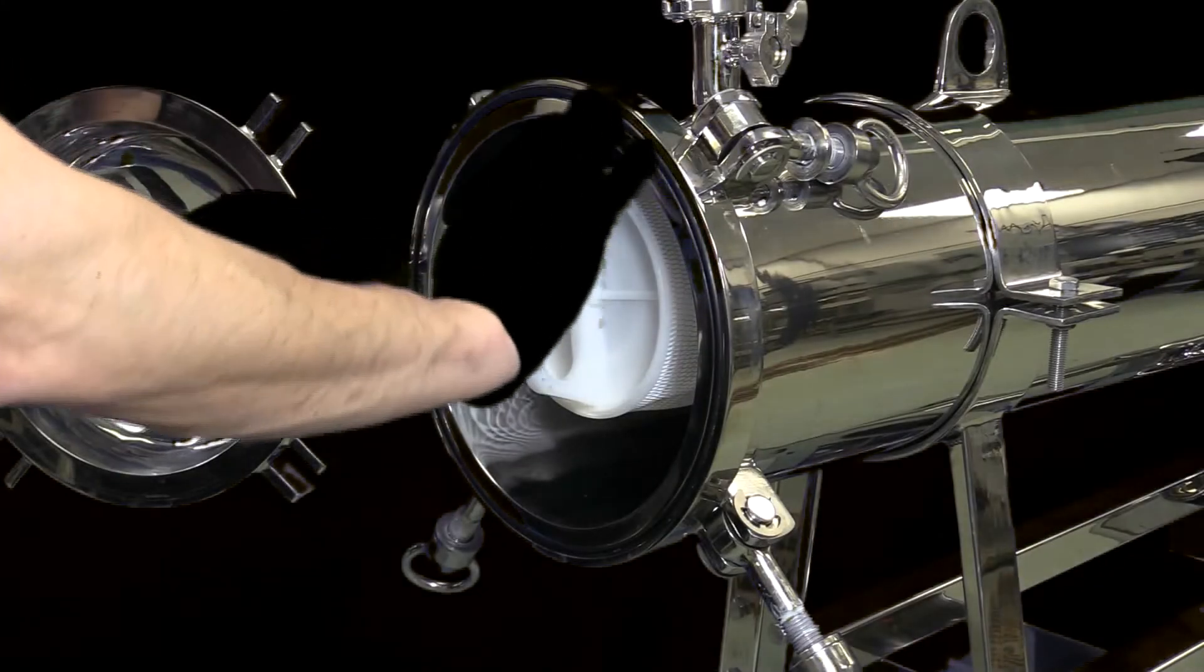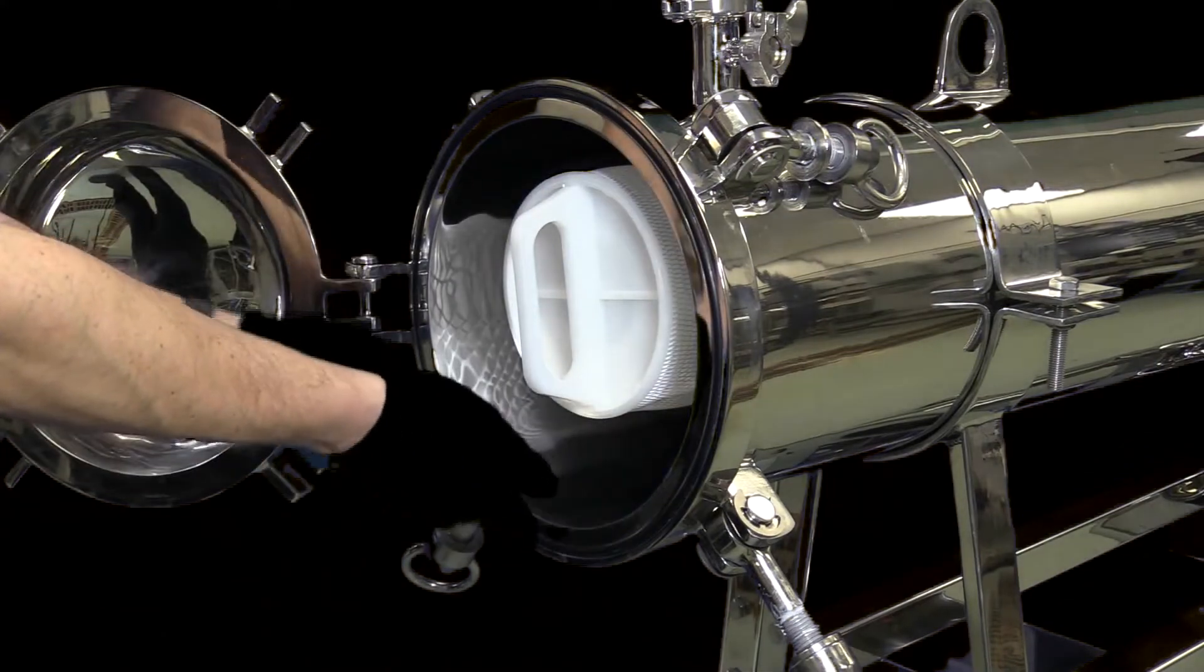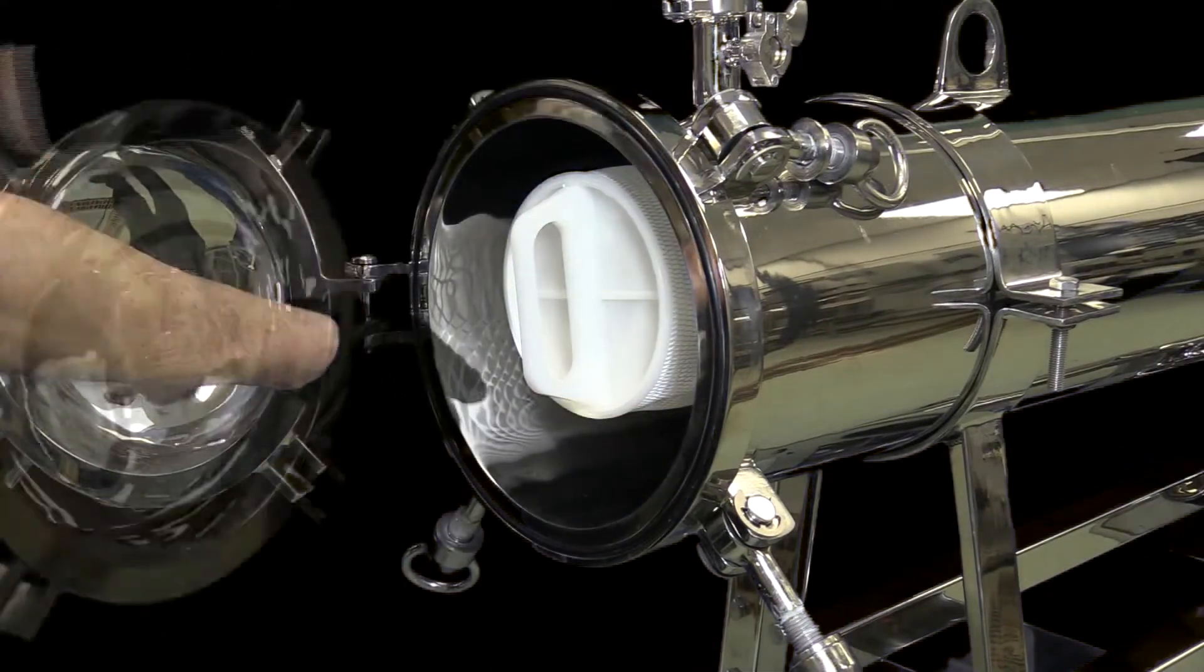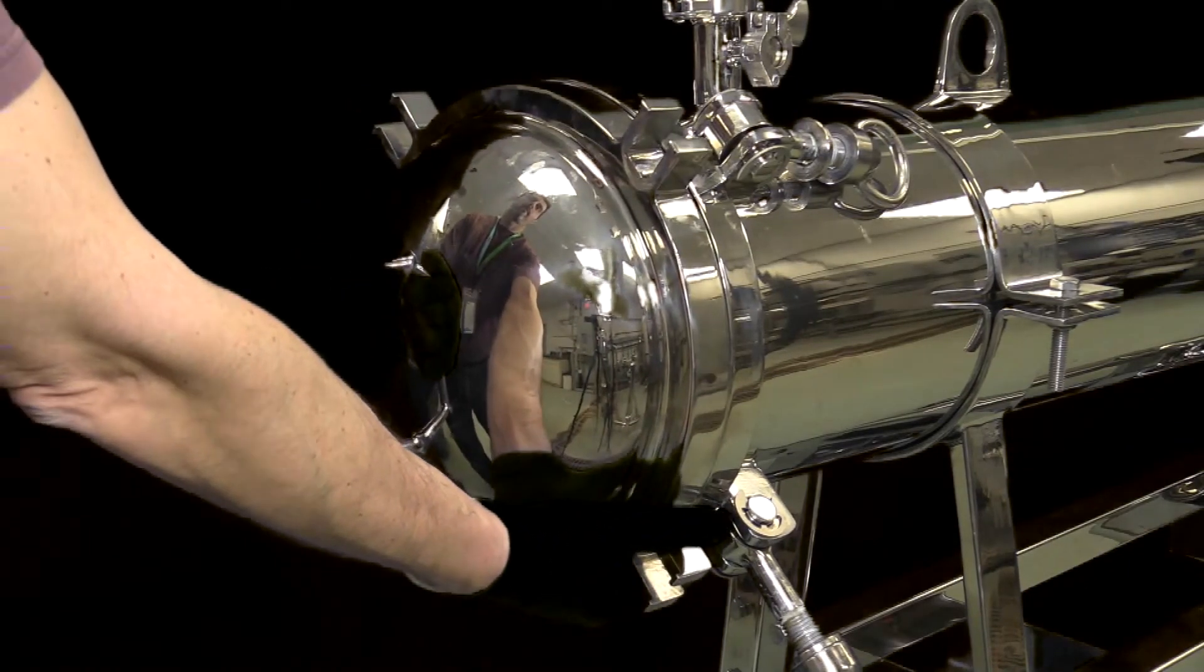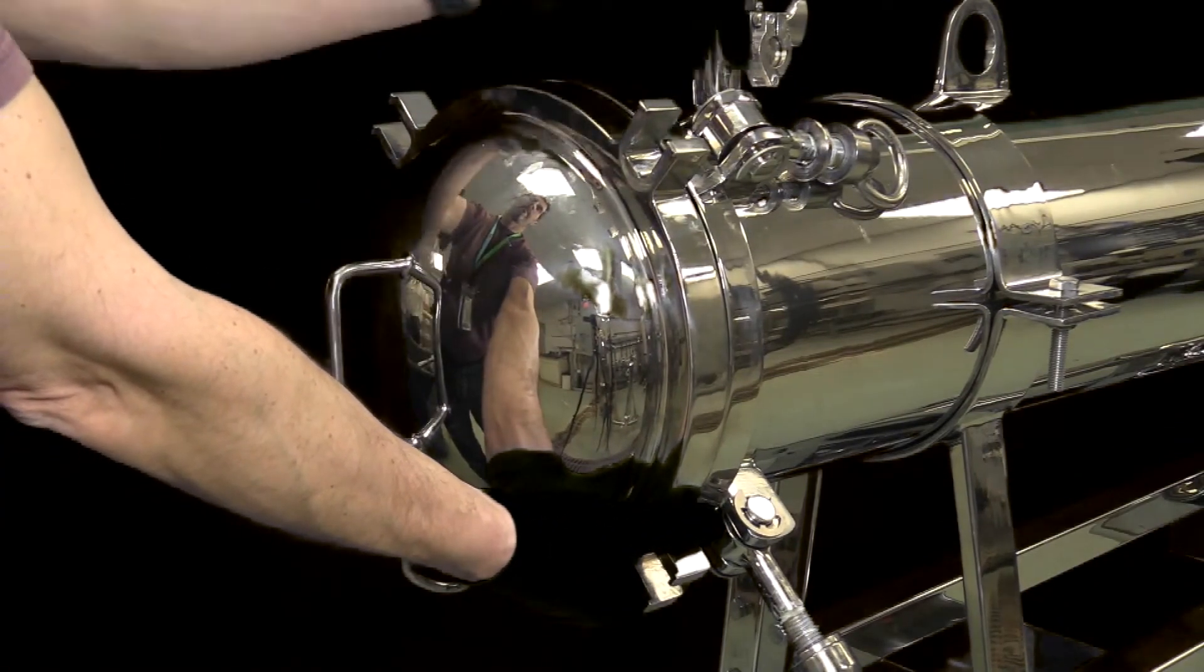Ensure the o-ring is properly seated in the o-ring groove on the housing. Grasp the lower right side of the housing lid and gently lift up until the housing lid is roughly aligned with the housing.